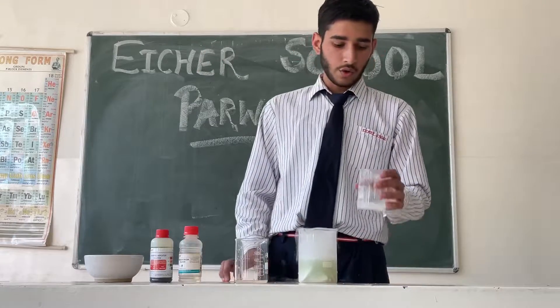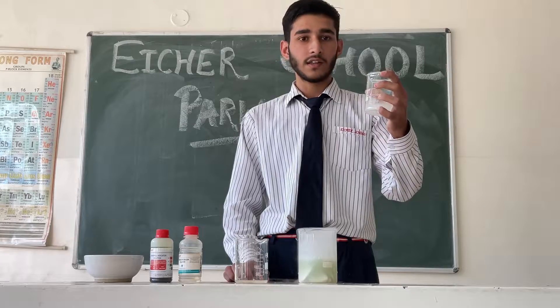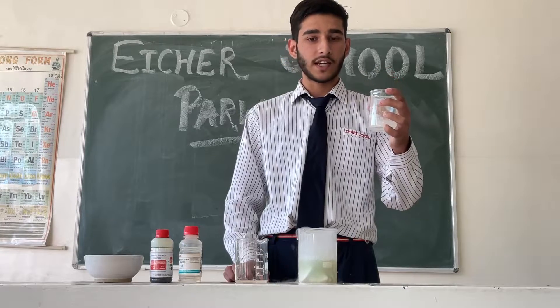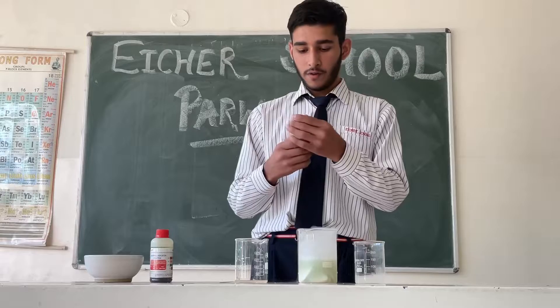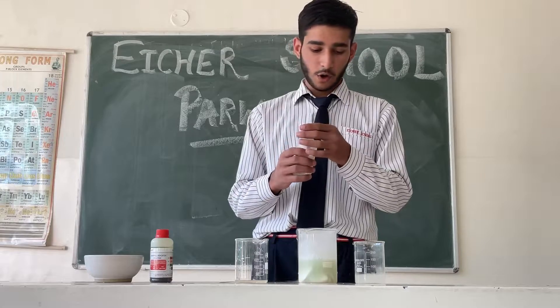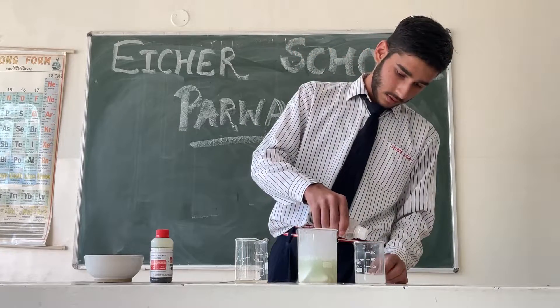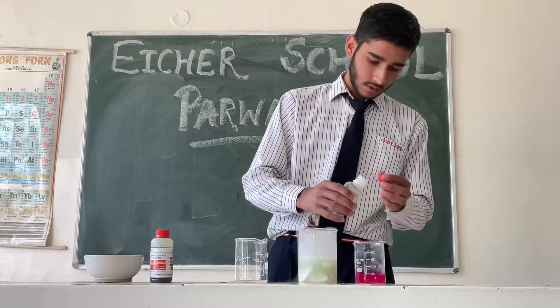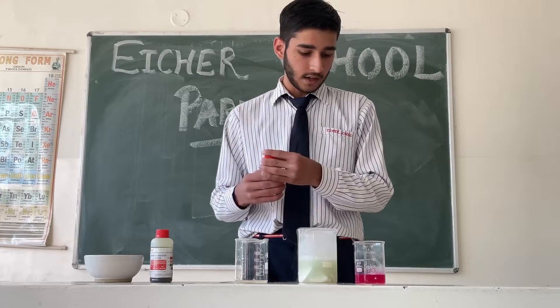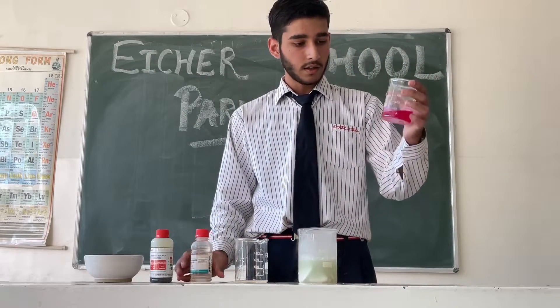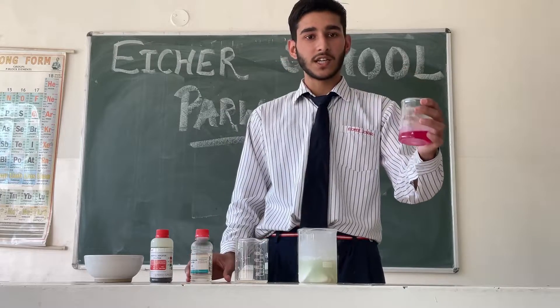Here I have saturated slaked lime which we took at the beginning of our experiment. Now I will put phenolphthalein into this. We can observe that the solution has turned pink, which tells us that the solution is basic in nature.